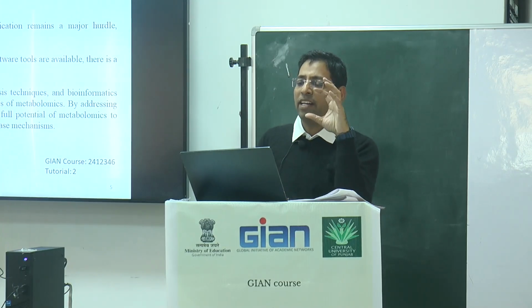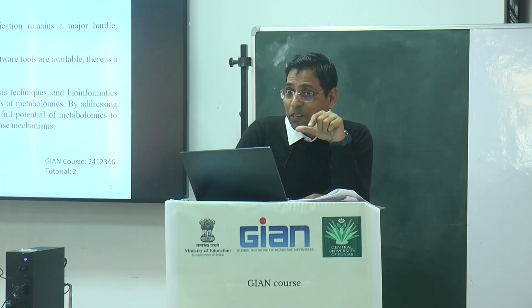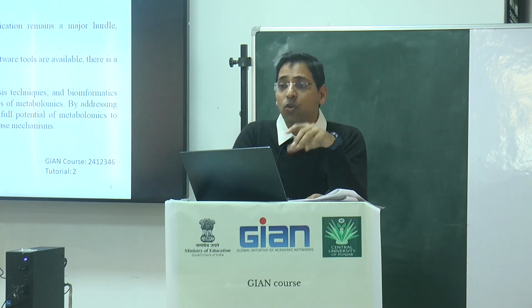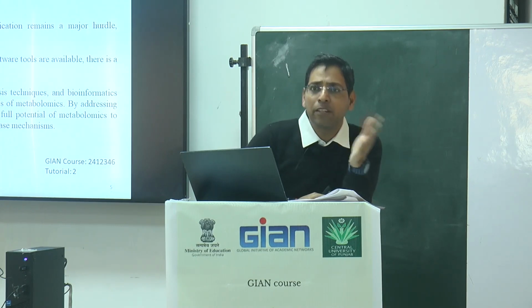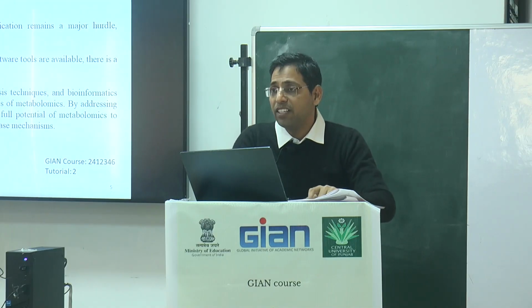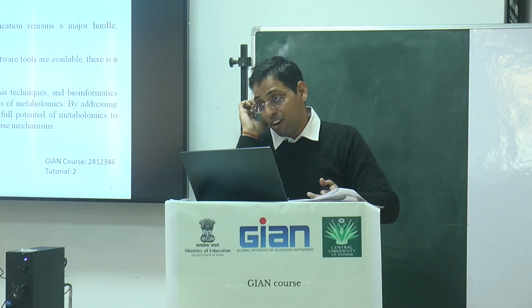The second point is the metabolite identification. Accurate and definite identification of the metabolites is really a hurdle task actually. You can say that it might be something, but to say yes, this is that compound, is a little bit difficult for you. And there is so much software available.